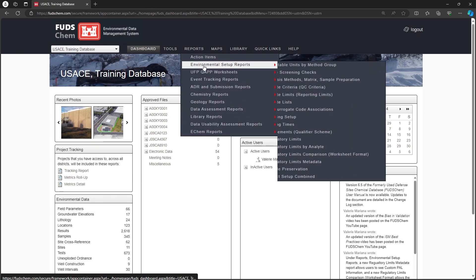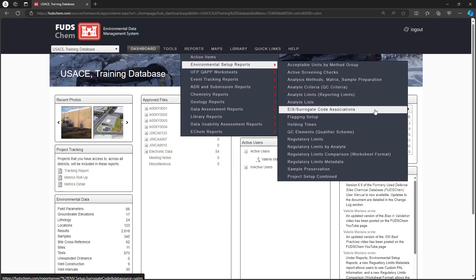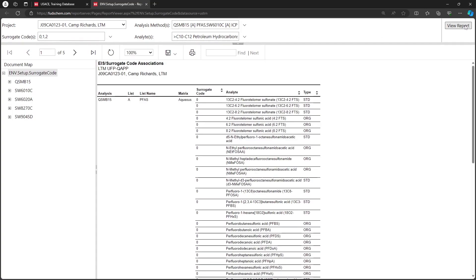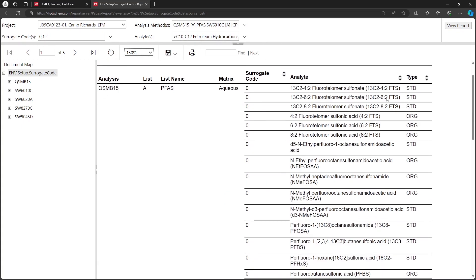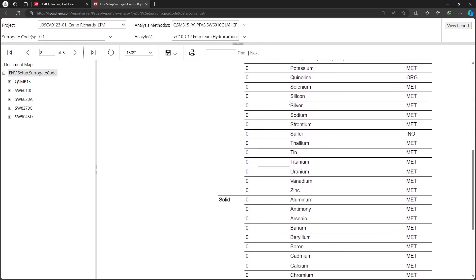Go to Reports, Environmental Setup Reports. Choose EIS, Surrogate Code Associations. Choose the project, adjust the other drop-downs as desired, then click View Report. This report lists the surrogate codes associated with each analyte. Analytes will be evaluated against surrogates with the same surrogate code number.